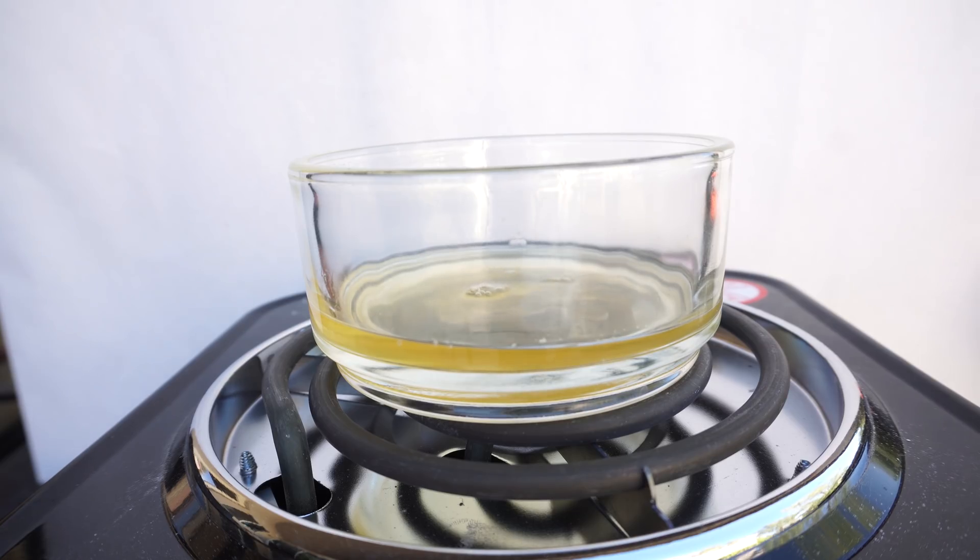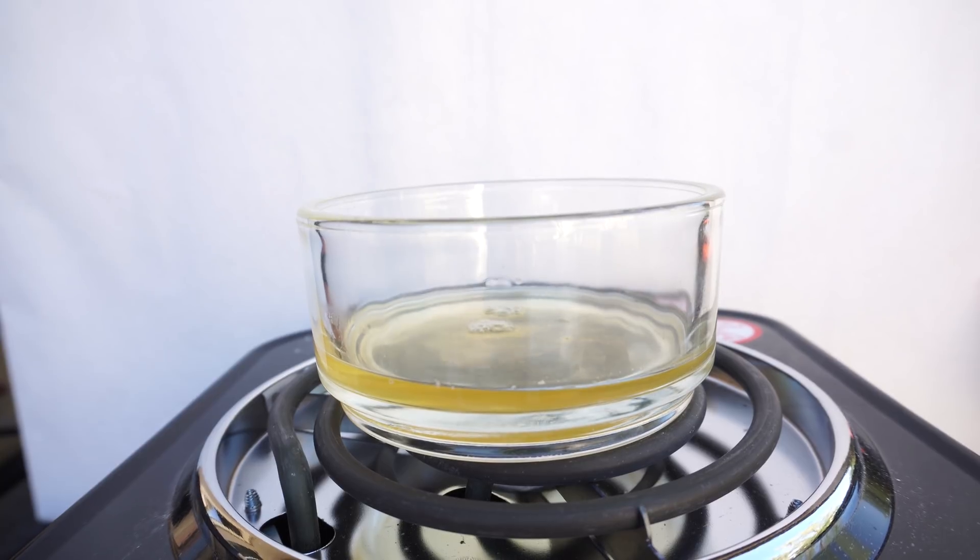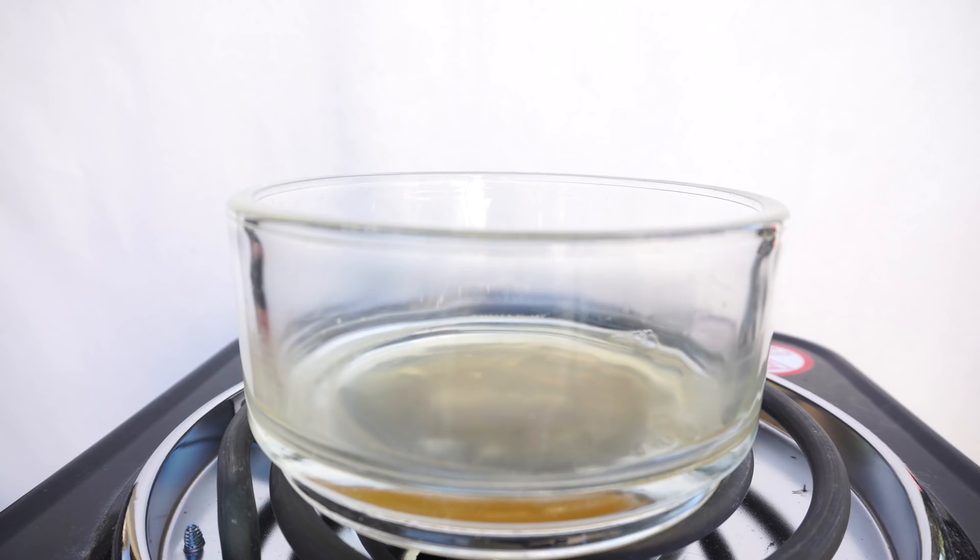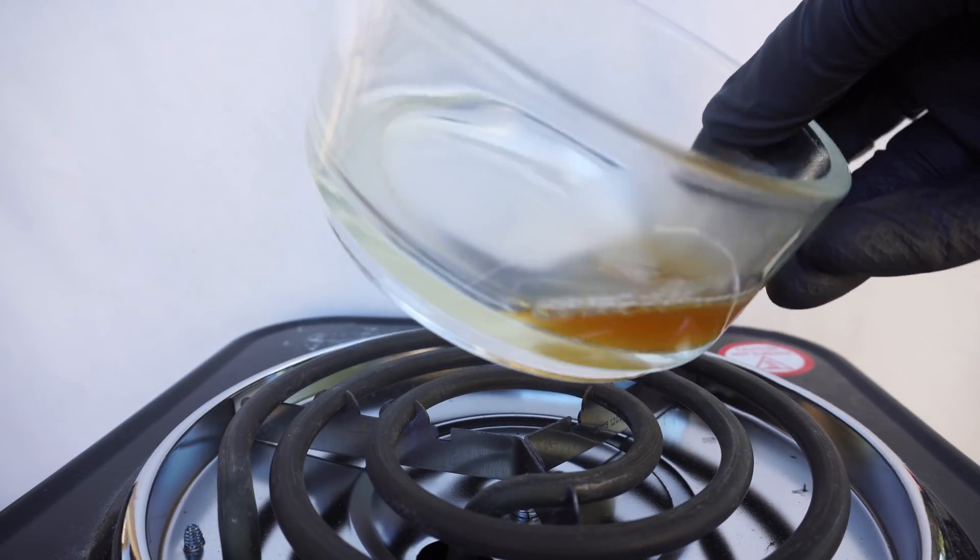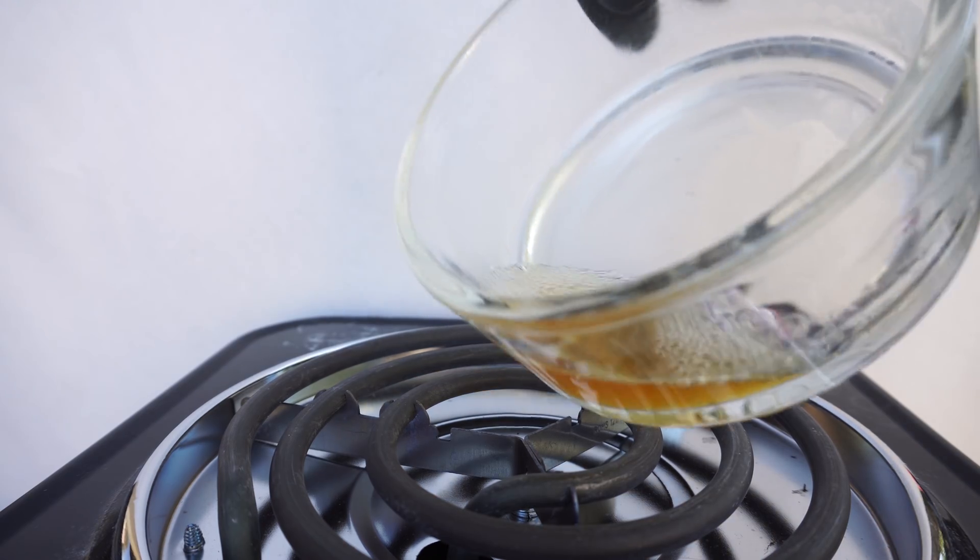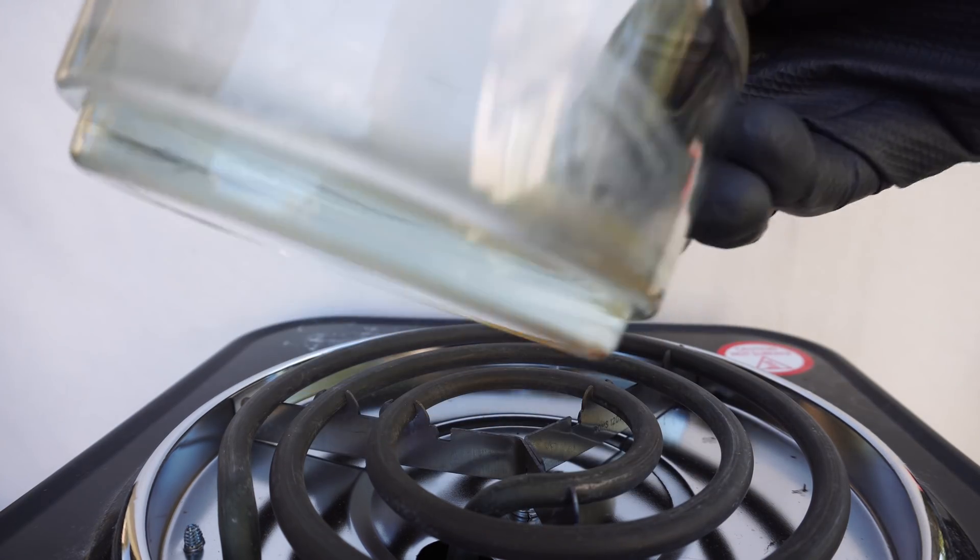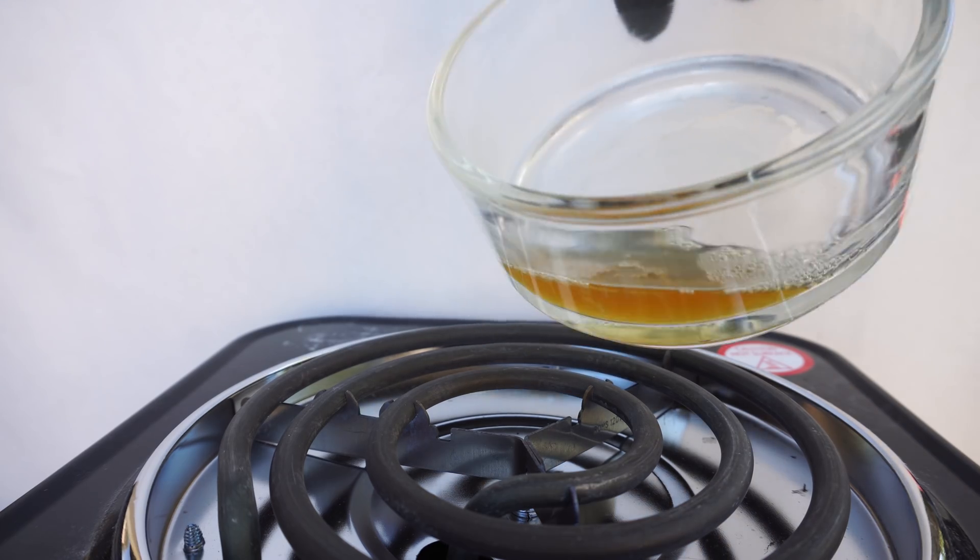From here, we will evaporate off the DCM. DCM boils at around 104 degrees, so it is better to take it slow. This will also make sure that the caffeine in the DCM doesn't burn as it evaporates, which is really easy to do. From my experience, anything more than a slow burn can actually burn the final product and you lose yield.